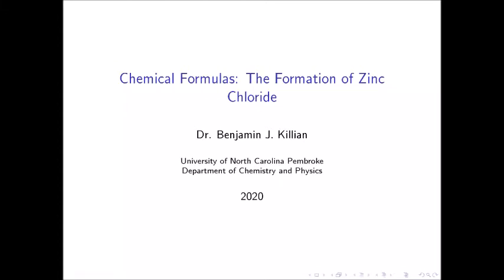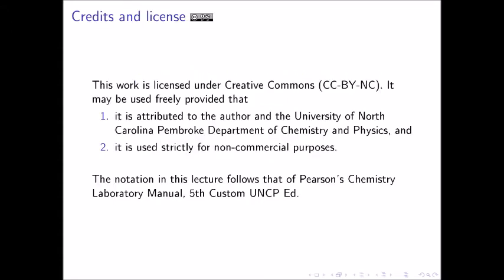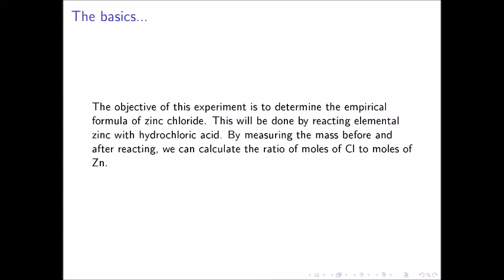This experiment deals with chemical formulas. We will be looking at the formation of zinc chloride and determining its empirical formula. The objective of this experiment is to determine the empirical formula of zinc chloride.